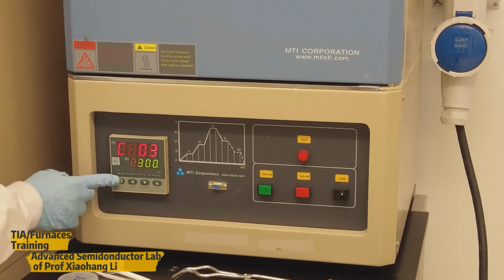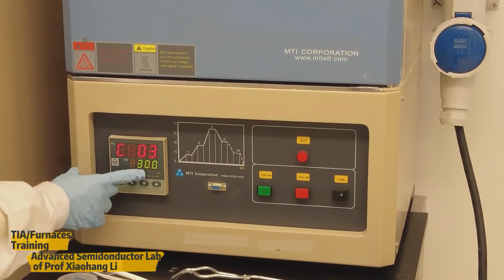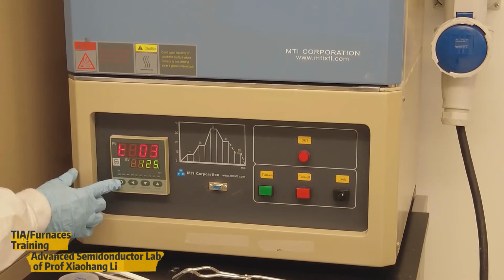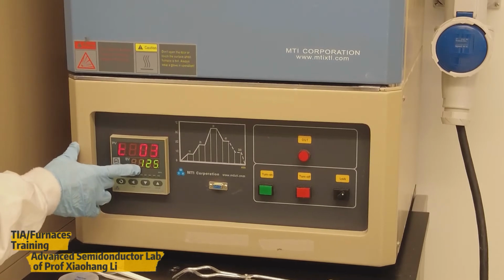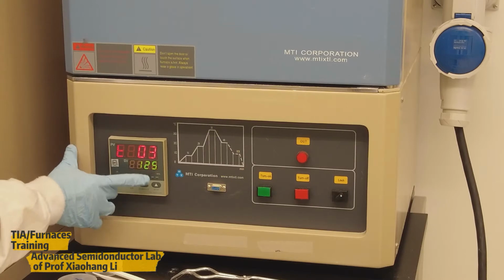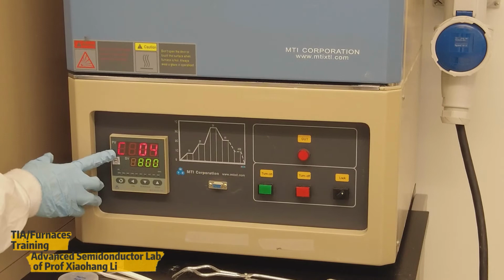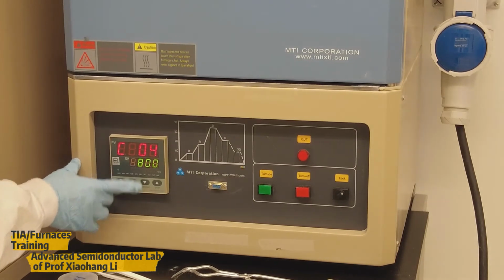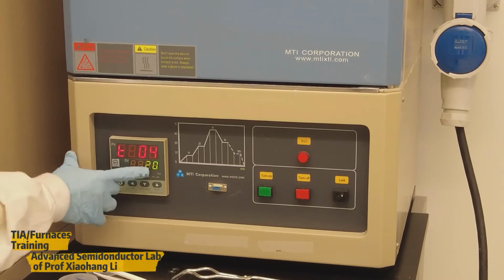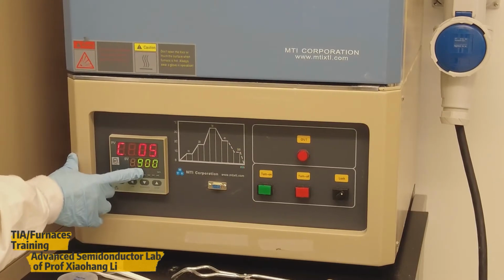So C3, the third temperature point, we still set 300. Then we go to 800 degrees C, so it takes 125 minutes. So T3, we set 125, reach to 800. C4, the fourth temperature point, 800. Then we can raise to the temperature we want. We will use 20 minutes to raise the temperature to 900 degrees C.